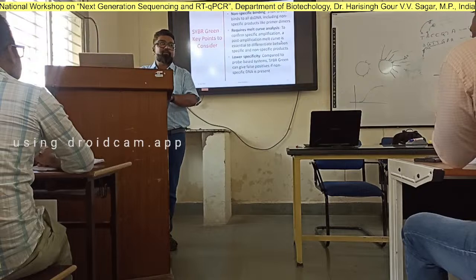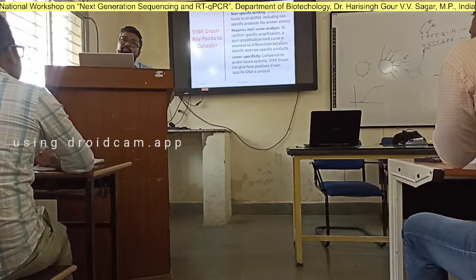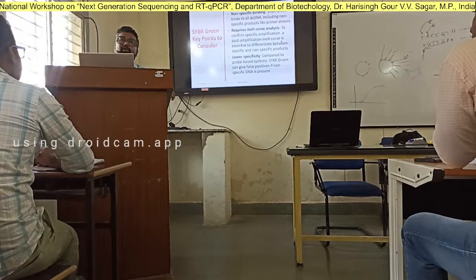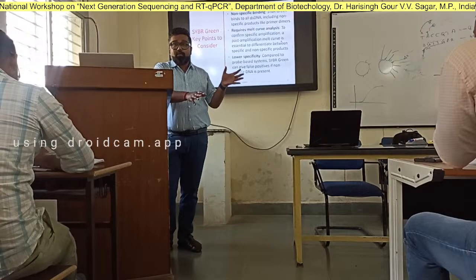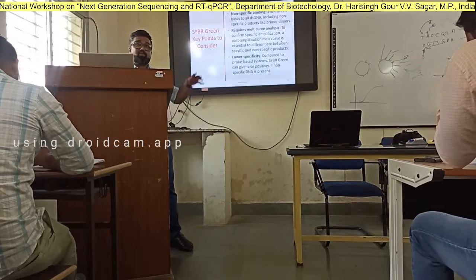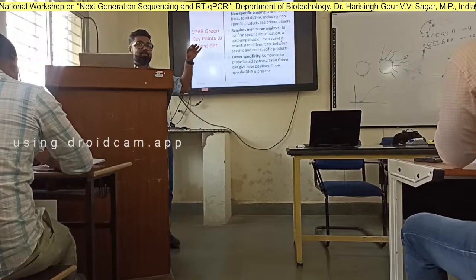I should have taken either the ligand binding domain or the signal domain. But at that point of time, it did not occur to me. Right? So designing a primer very thoughtfully will cut down a lot of work when it comes to optimizing your assay for yields and PCR. So first design a primer, check it out in silico, and tick these boxes.